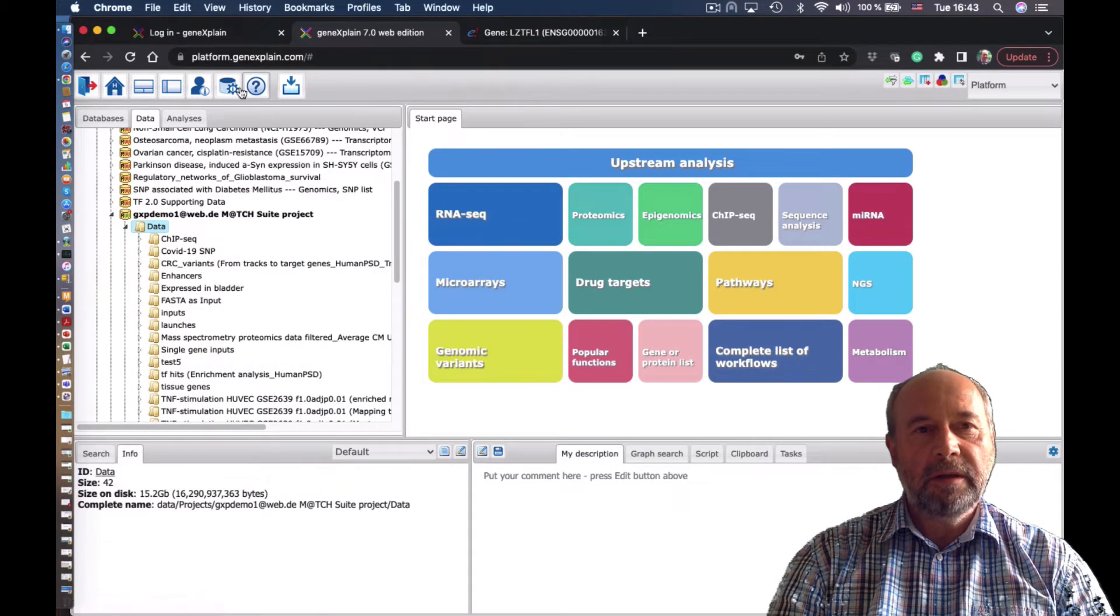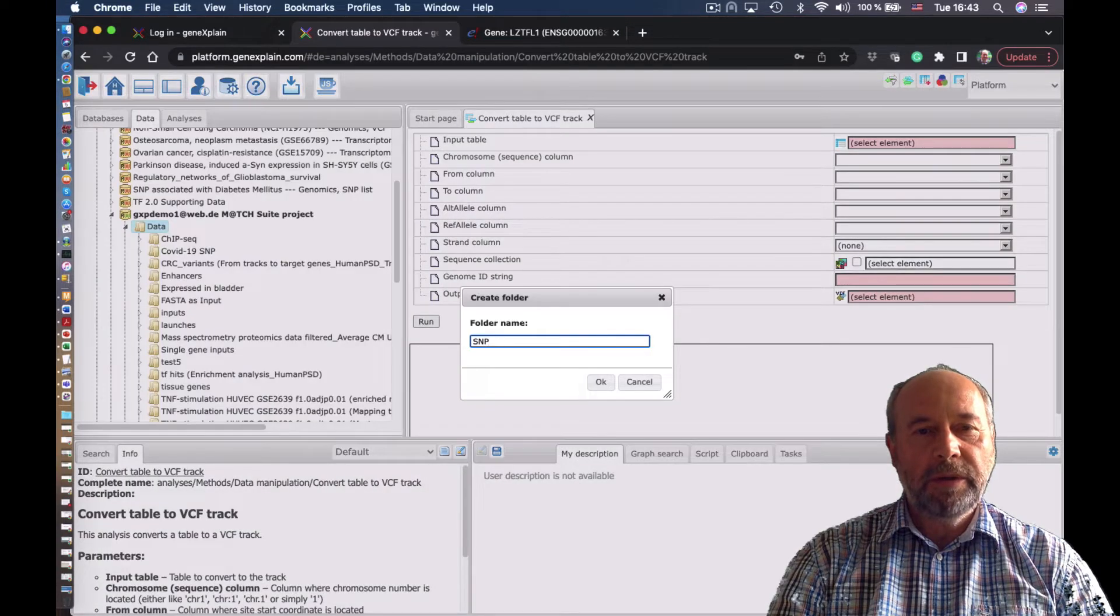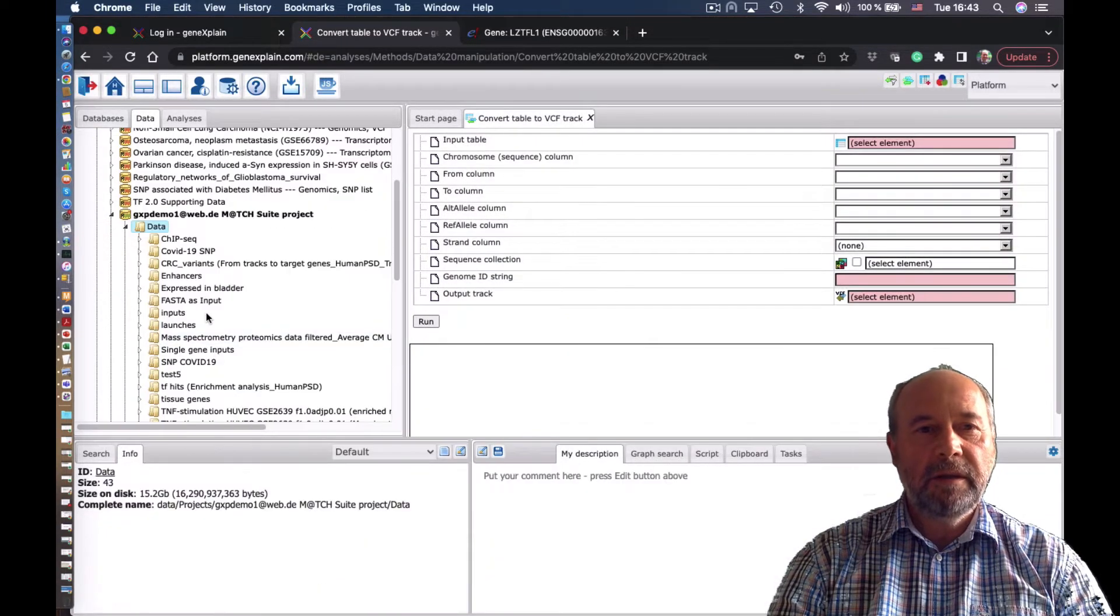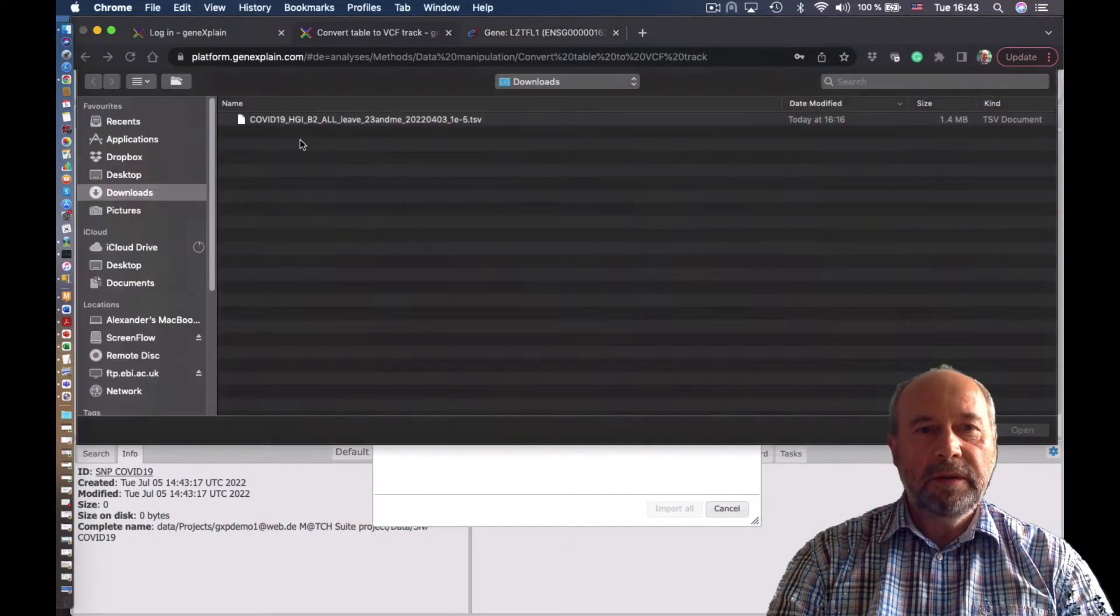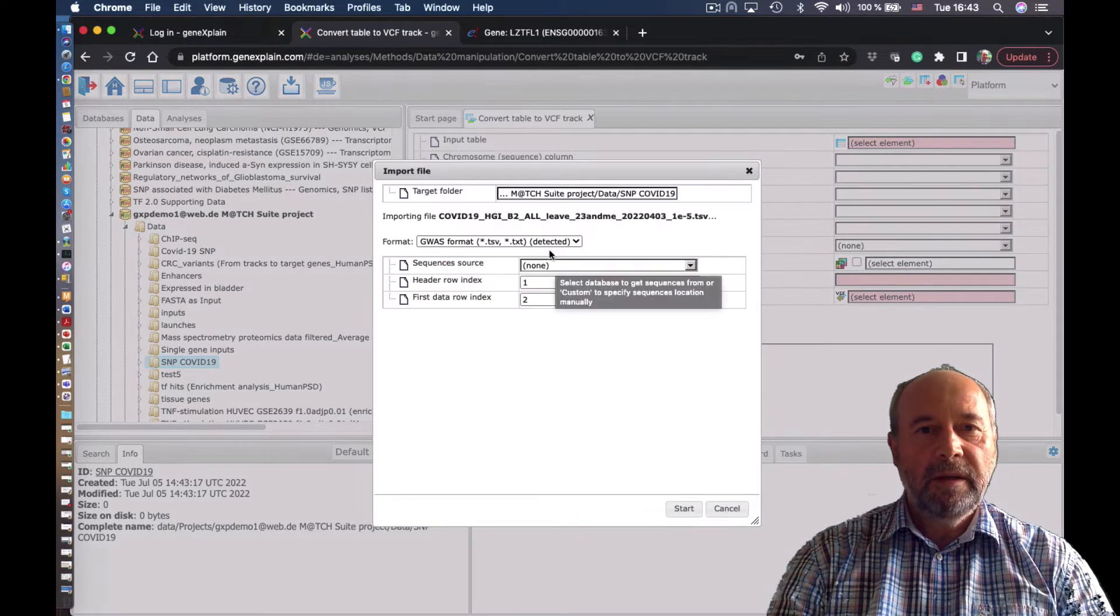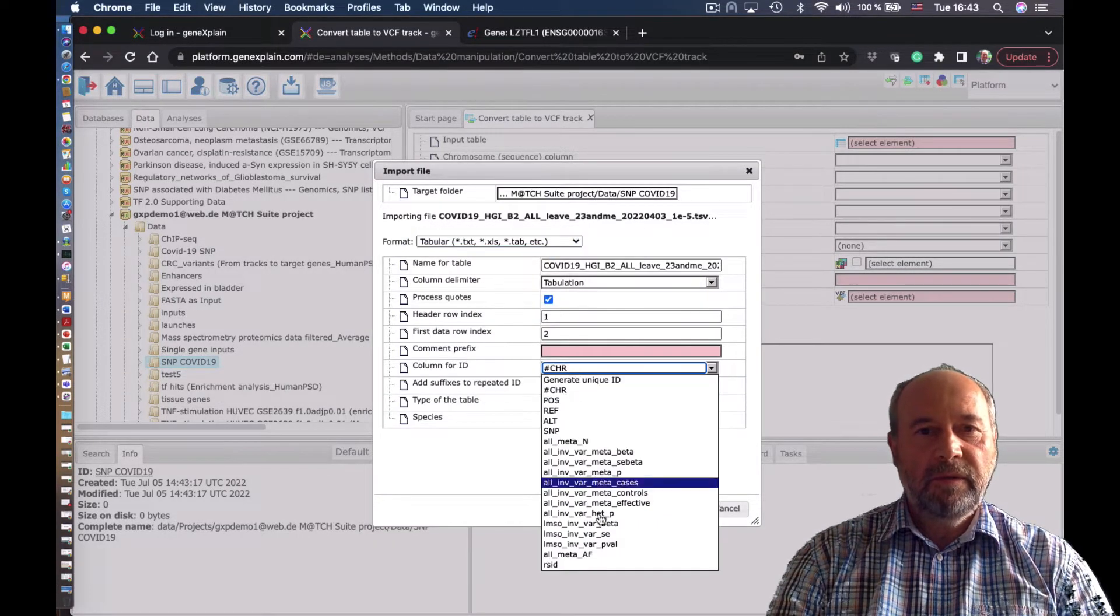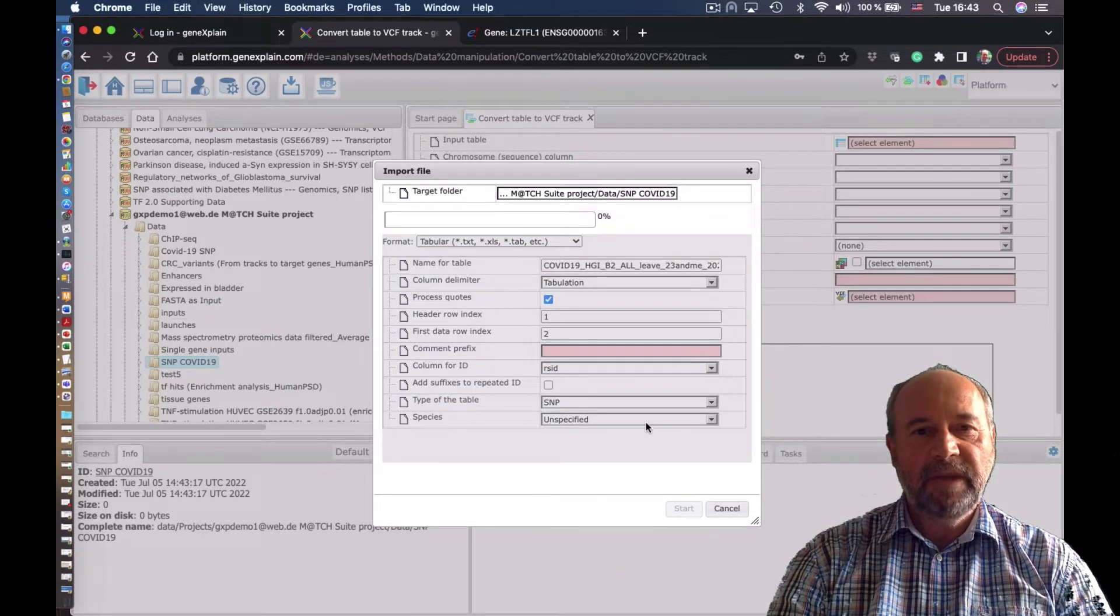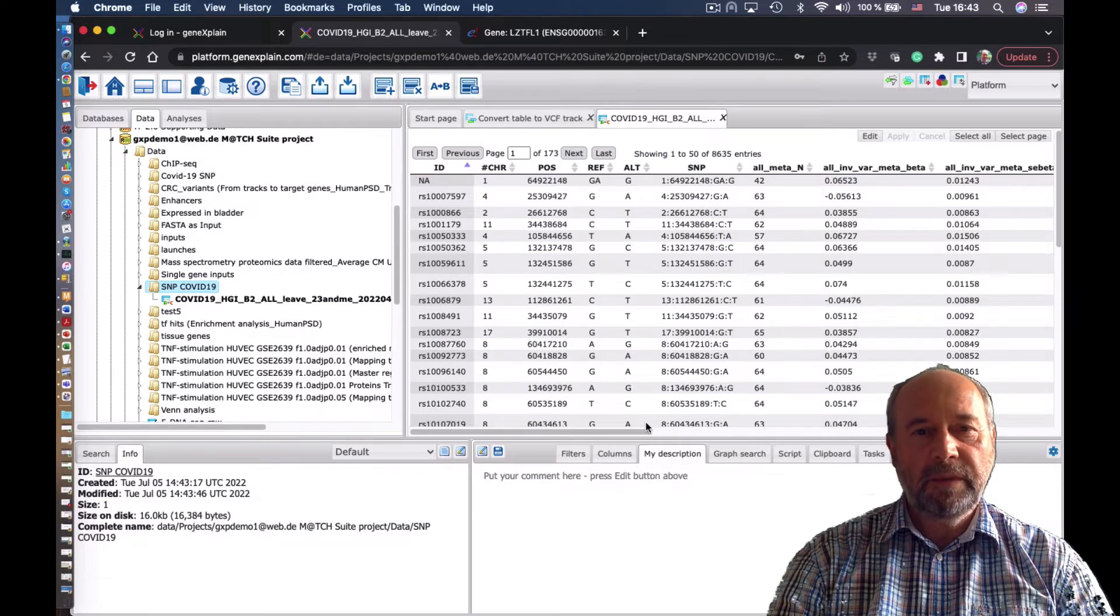So we start here the GeneXplain platform, we log in, and we would load here the SNP data. First, let's create the project and the folder where we can save the data. So now we load this data from the database, from the SNP database. They are now loaded. We have to select the proper format for loading. It's SNP data.